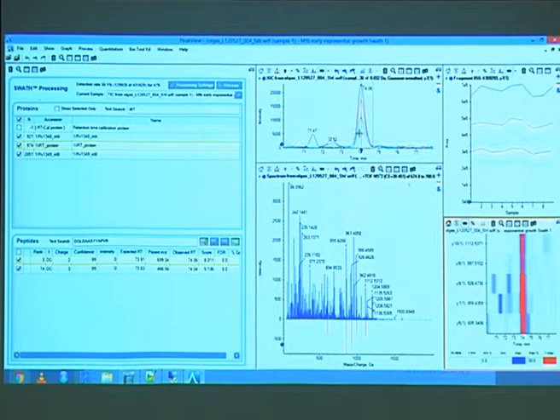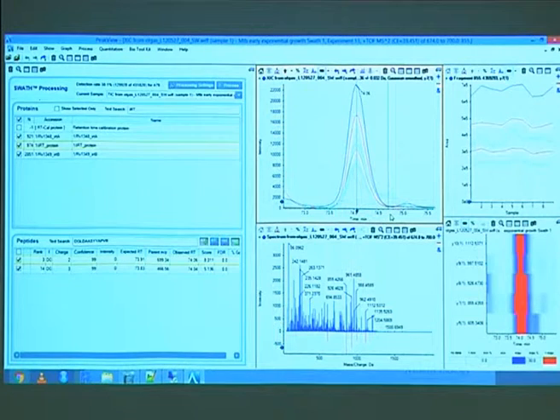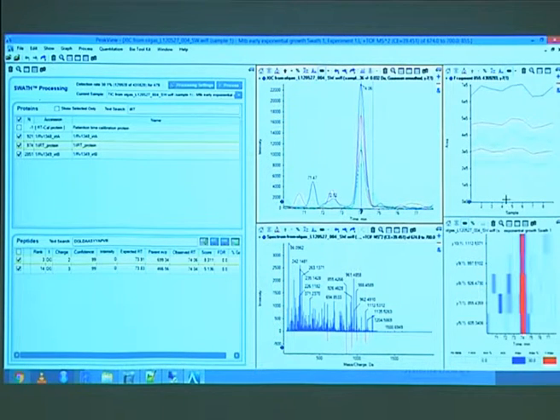I just moved the pane over here so that one gets a bit bigger, and I make that small. These windows are all interactive. So you can go down here and zoom in. You can also zoom in this range if you want. By double clicking next to the axis, you zoom out again. Like this.